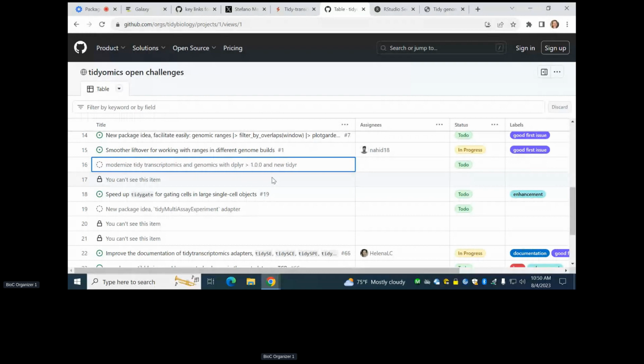Well, two sides of this question. One is I want to reiterate that these are not analyses. So if you use parallelization on your analysis, this doesn't involve that. But what this provides, that Michael showed very elegantly, is that you can nest if you want to do some operation on every cell type or every sample, like normalization or whatnot. You can nest the datasets very elegantly, and there is furrr that uses the map function. You need to know what purrr is and so on, but all the operations you do on the nested data are very easy to parallelize, send to a cluster, with not much coding, actually changing one function for the other. So there is future_map that allows you to parallelize that. So in this case, we can parallelize analysis, given the function that you use to analyze. But through the nesting, this can happen very elegantly and is all self-contained. So you're not creating global variables, which is also quite robust.